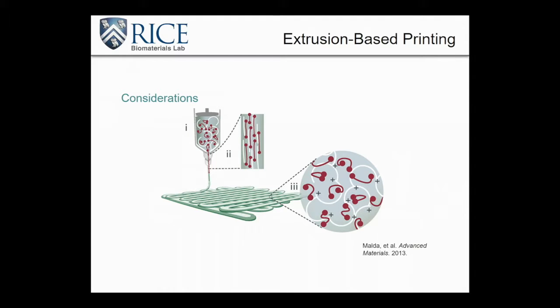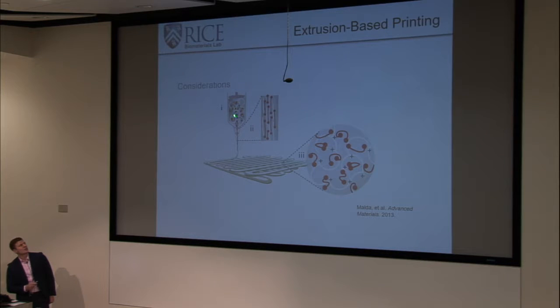So as I promised, one of the things that we're interested in here is gelation and how shear thinning and shear forces affect the bioinks. So in this case, we can see just an example of when the gel is just in our syringe, for example, how the gel is relatively relaxed, and as soon as you apply pressure to squeeze that through a nozzle, you start aligning fibers, and so you can imagine for the cells that are in here, you're getting actual fluid flow, which imparts some of those shear thinning effects, and then as you print that out, you go back to a more relaxed state and an entangled state.